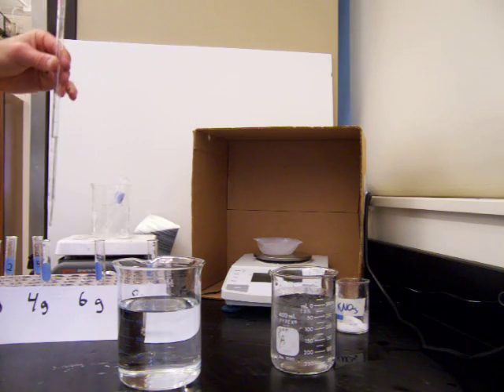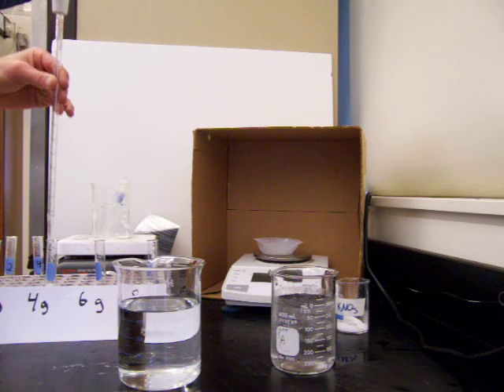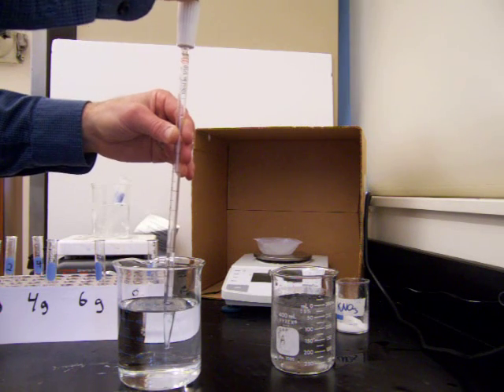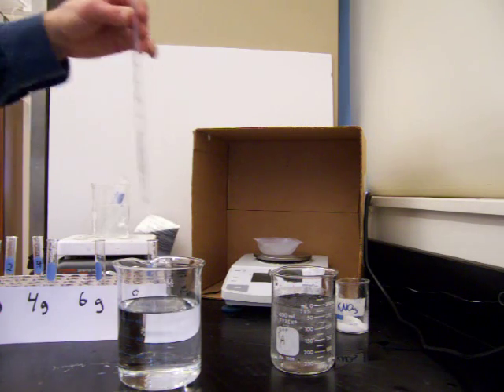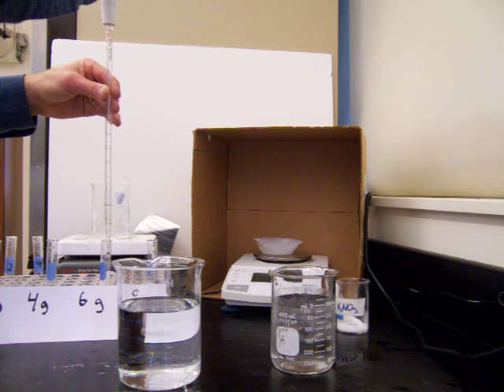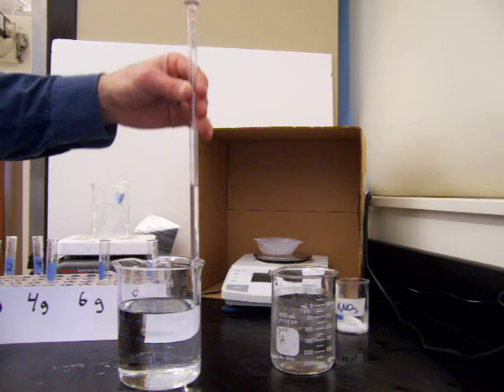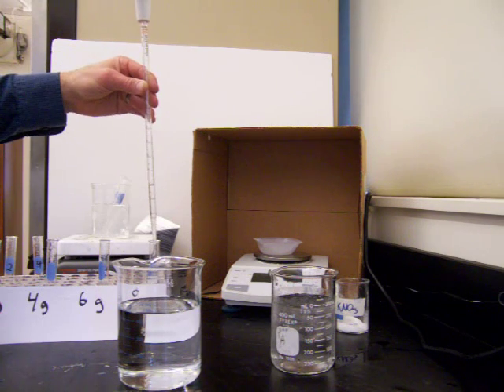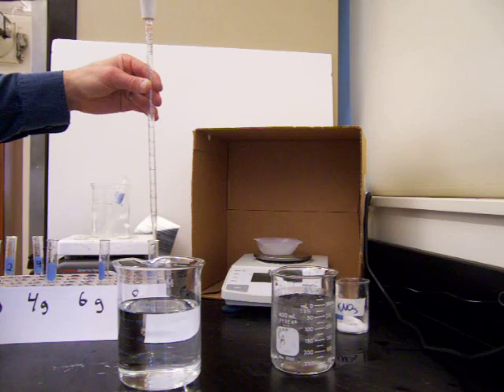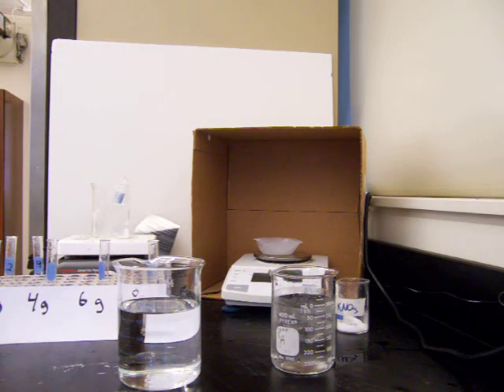We're trying to make solutions here with different concentrations. Concentration is the ratio between solute and solvent. Our solvent here is water, and we're having 5 milliliters of water in each of our solutions. Then we'll vary the amount of the salt, potassium nitrate.